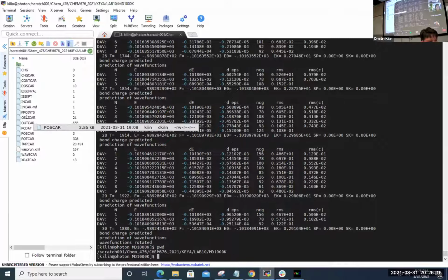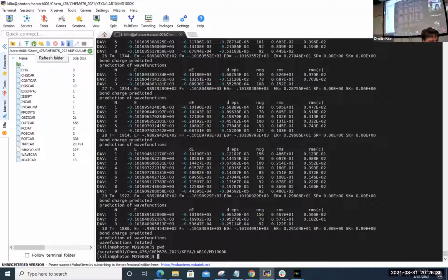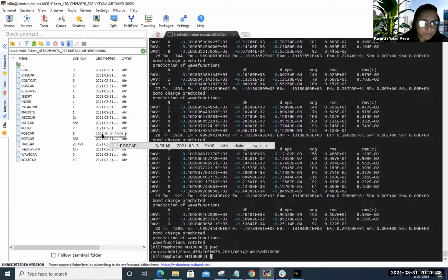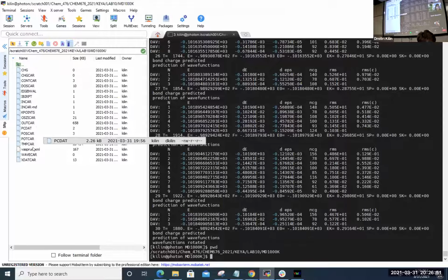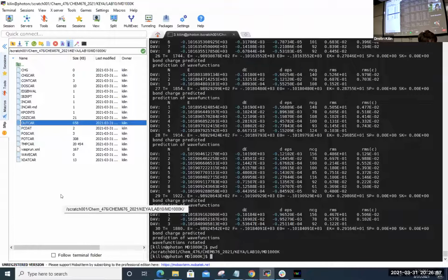Go up and click this green circle to refresh. Next one line up. Yes. Click, refresh. Now, can you please make the sidebar bigger and the main command line small? Yes, pull this one. So let's compare. I think it is slightly different things.